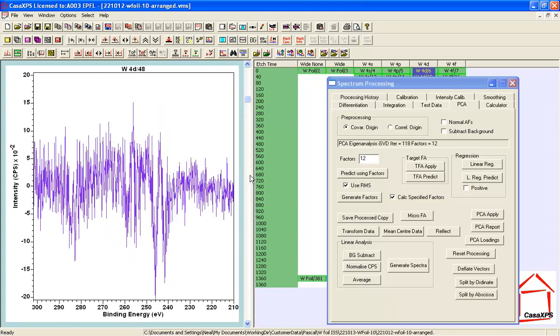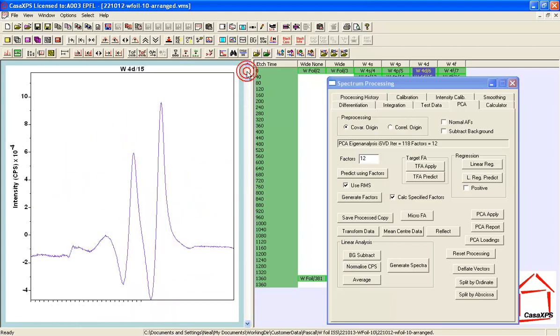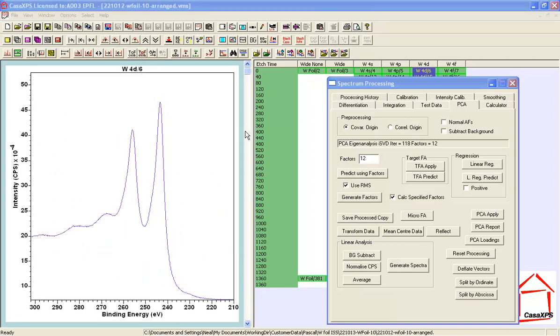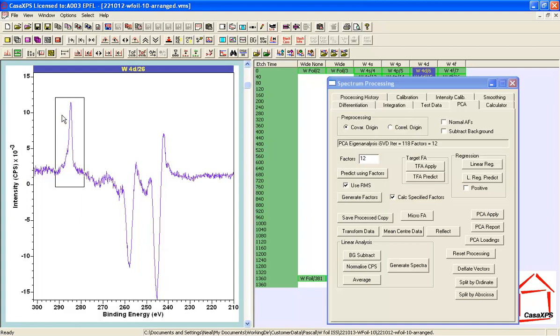Noise is due to pulse counting, so we're only interested in signal that creates shapes in the data. I highlighted this carbon peak because I believe it's only at the surface, so for the majority of spectra in this profile there will be no influence from carbon. Because we are performing a principal component analysis where there is some carbon in a limited number of spectra, its presence in these abstract factors means it's altering the calculation to accommodate the carbon. So I ought to analyze only spectra that do not have carbon.